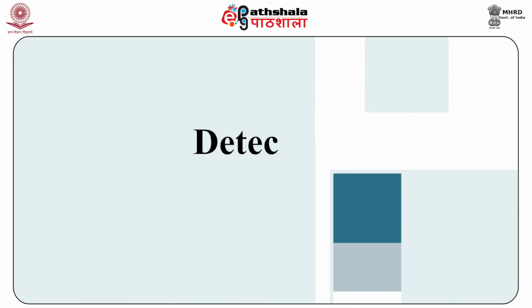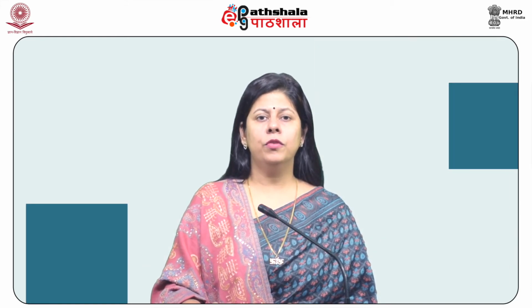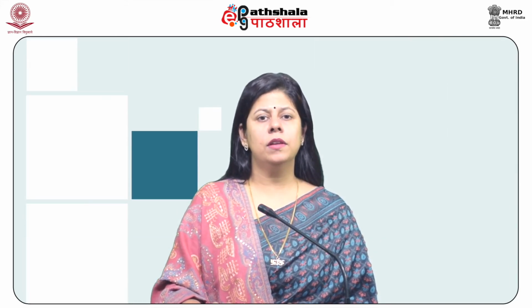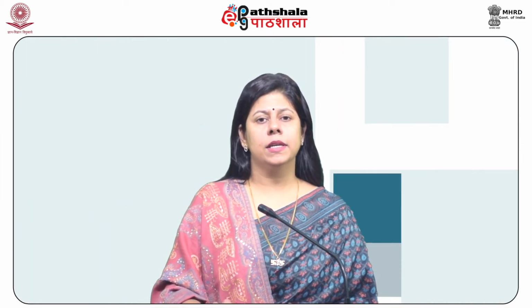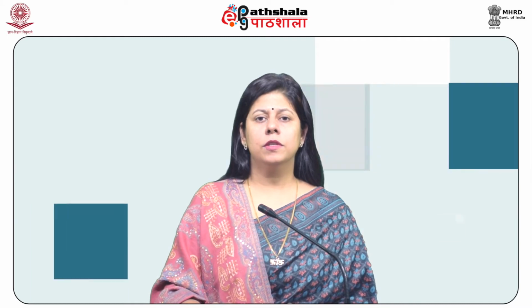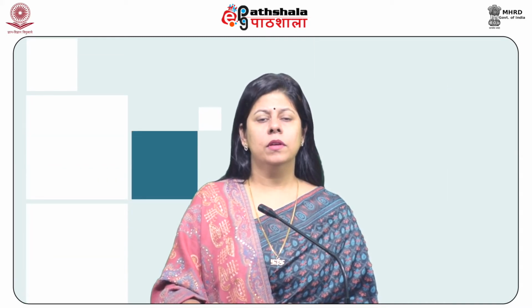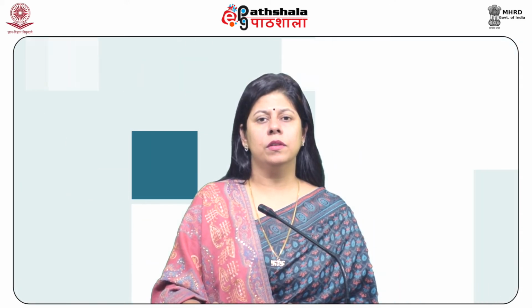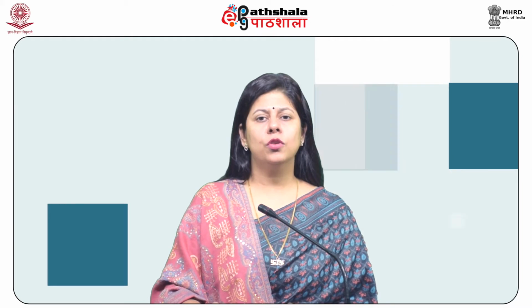The next component is the detector. Excluding the near infrared, where the photoconductivity cell is generally used, there is no better choice than the thermal detectors. These give response for all frequencies when the radiant power is low for the infrared region. It means that the detector signal will also be low.